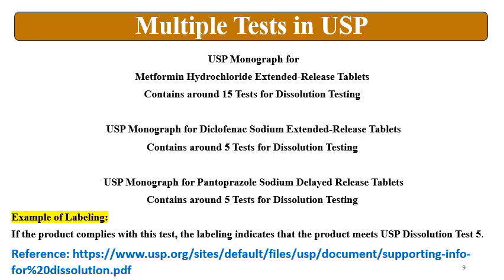Another is the USP monograph for diclofenac sodium extended release tablets. This contains about 5 different tests for dissolution testing. The USP monograph for pantoprazole sodium delayed release tablets contains around 5 different tests for dissolution testing. And the example of labeling: if the product complies to this test, the labeling indicates that the product meets USP dissolution test 5.